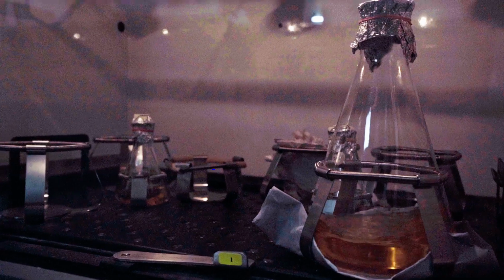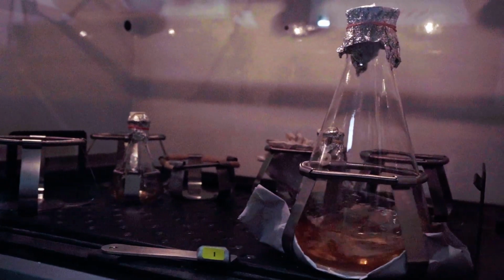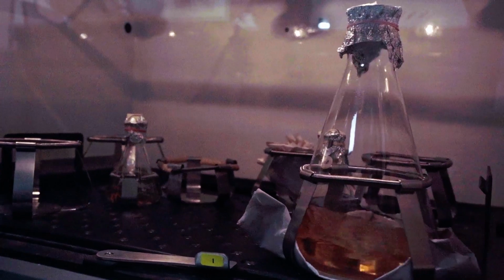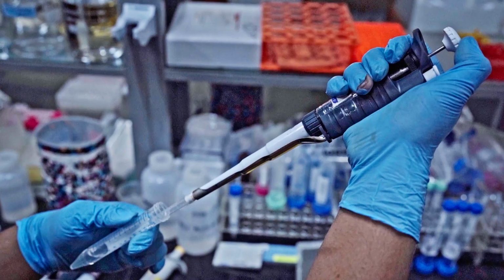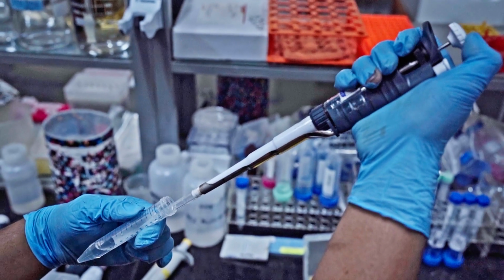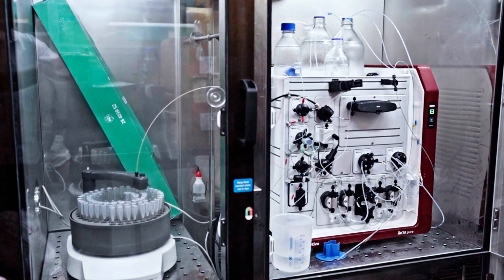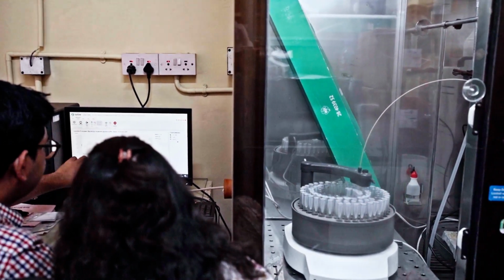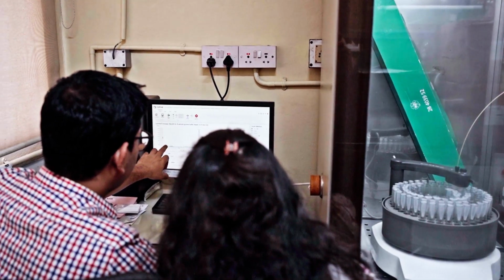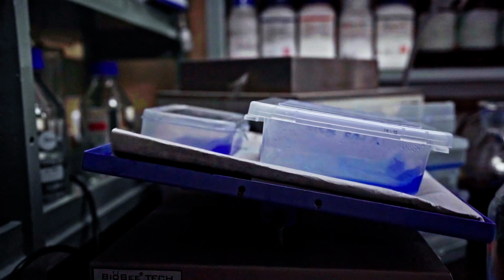So the research that we perform in our lab actually looks into how different macromolecular assemblies assemble inside the cell, and then they perform different functions. More specifically, what we are interested in looking at is how different cytoskeletal elements, which provide support structures for the cell, as well as the protrusive forces needed for different functions inside the cell. So we look at how these actin cytoskeleton assemblies are assembled inside the cell in response to different signals.